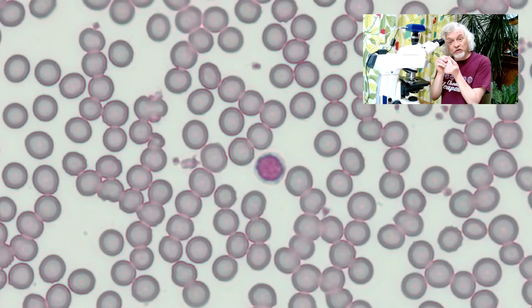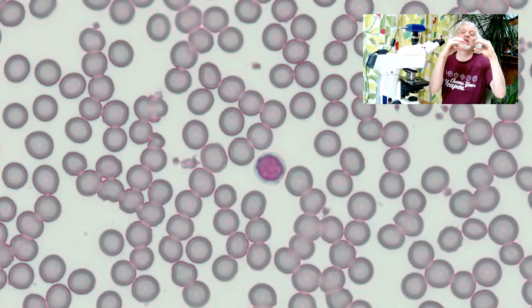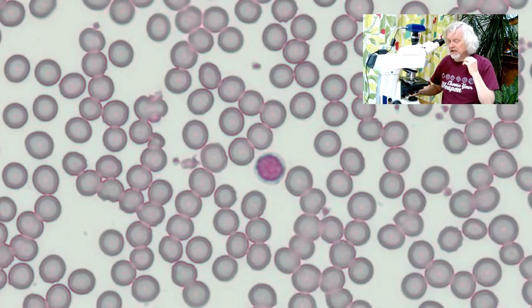I bled profusely from my fingertip because the capillaries, the very fine blood vessels, allow blood to go through. The only reason the blood can get through is because the blood cells can sort of bend and fold on themselves. The blood cell is kind of donut-shaped, with a flat bit in the middle. It's not a donut with a hole in the middle, it's a donut with a flat bit in the middle. And you can sort of see that here.